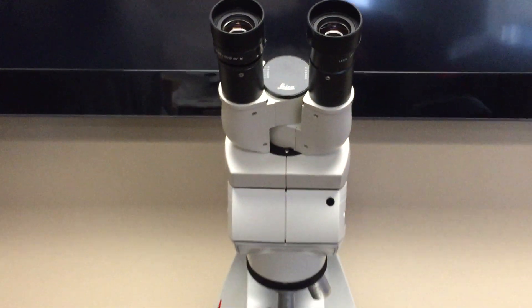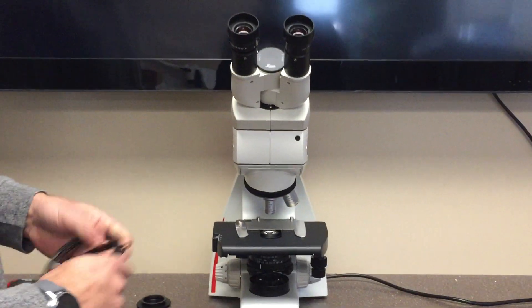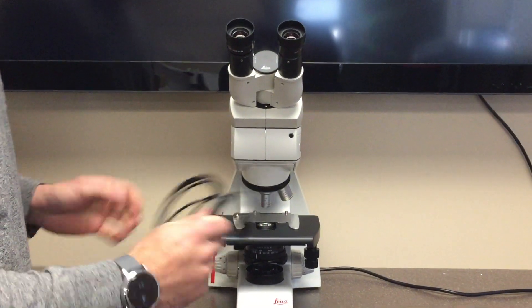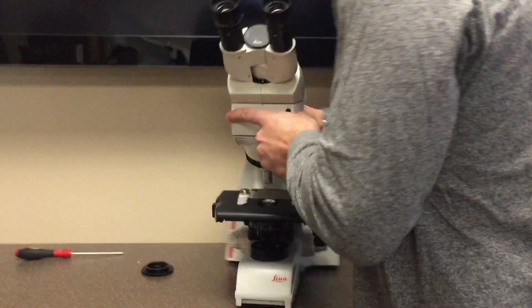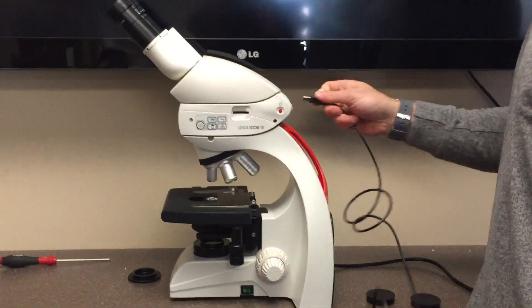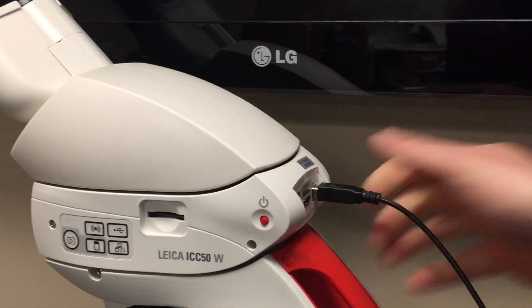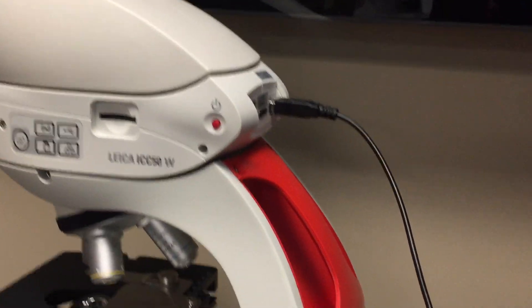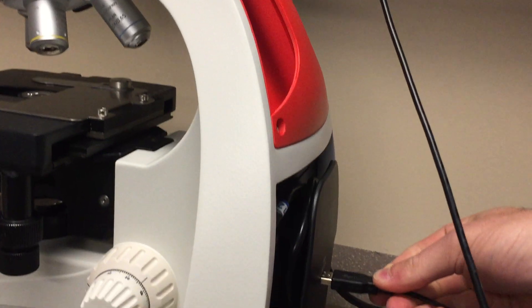Now the microscope is fully assembled. We're going to power the camera via the USB cord included. The camera runs off the USB cord, which plugs into the back side of the camera, and the microscope has a convenient USB power supply located in the back.